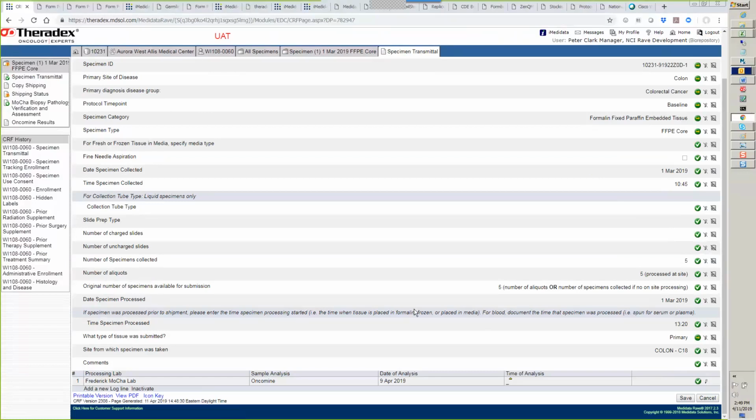Agreed. I do agree with you, and I think it's good for us to have a discussion offline, whether it's some kind of an API process where you might have a spreadsheet or something that is uploaded and then processed by automation, or some batch process that works with the forms here. That's something we'll discuss and figure out what would work best.